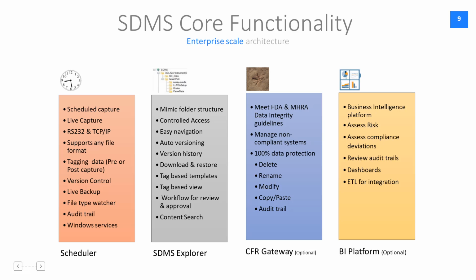You can create a template based on the product and the batch number as the template for viewing your data. There is a workflow tool available which will allow you to review and approve your data based on your user roles and rights. Users will be able to review and approve data generated by different instruments and users.